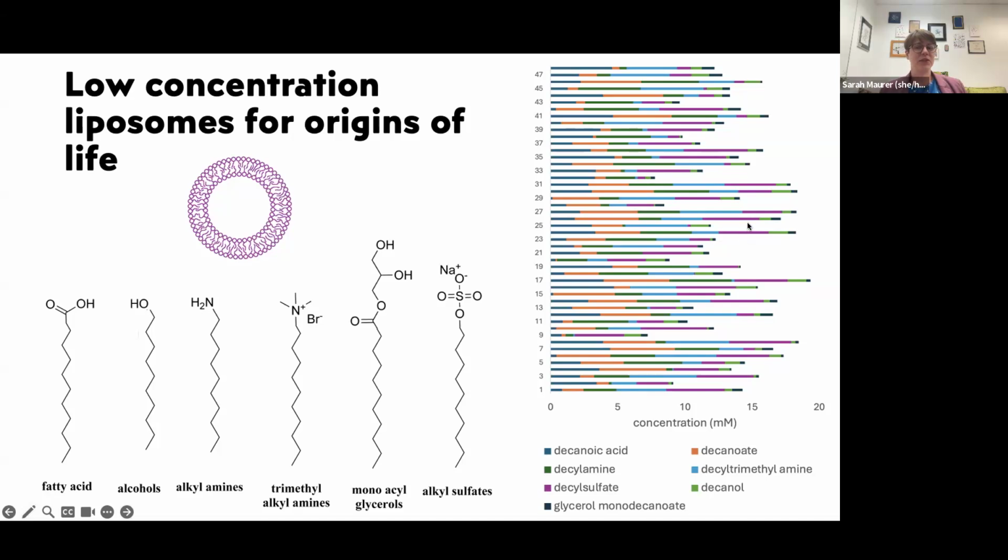Kinetics versus time course. So we know that single chain amphiphiles are more dynamic than phospholipids. And some of my previous work shows that fatty acid vesicles fuse over time, and that's a temperature dependent process. They probably also split over time because we're not seeing really huge vesicles only. We see lots of little vesicles still too.